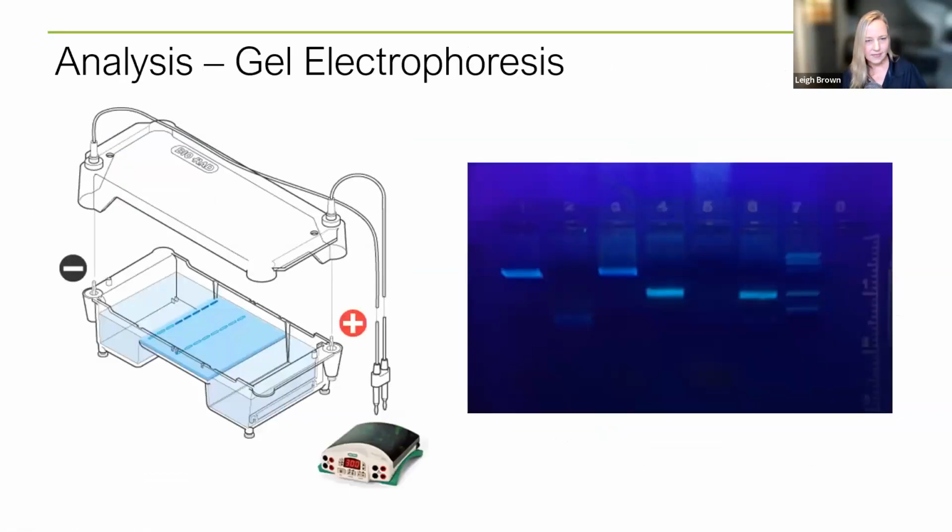Okay. And for conventional PCR, the detection of the PCR reaction occurs at the end. So once your thermal cycler is done running, this might be 2 to 3 hours later, typically, you're going to take samples out, add a stain or loading dye, run a gel, and see what you've got.